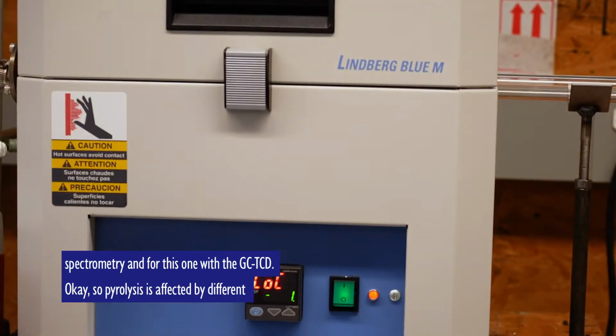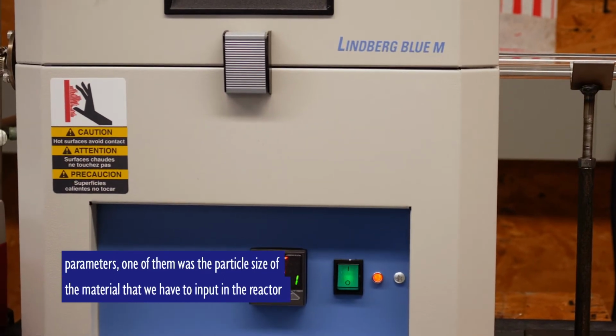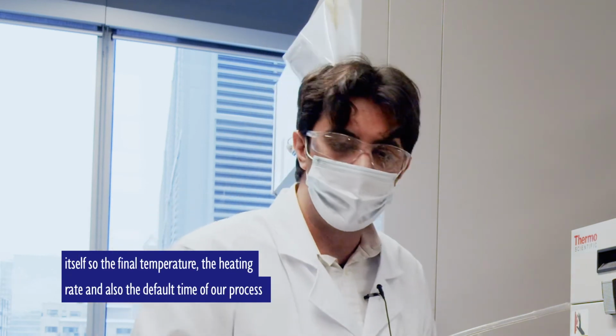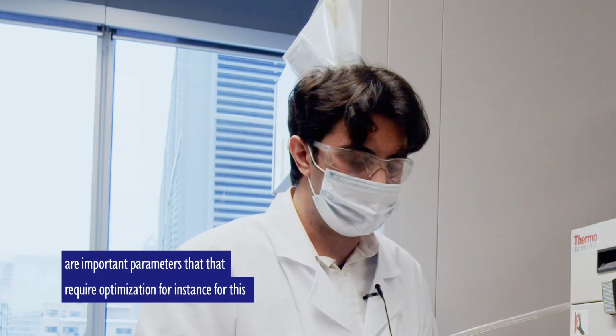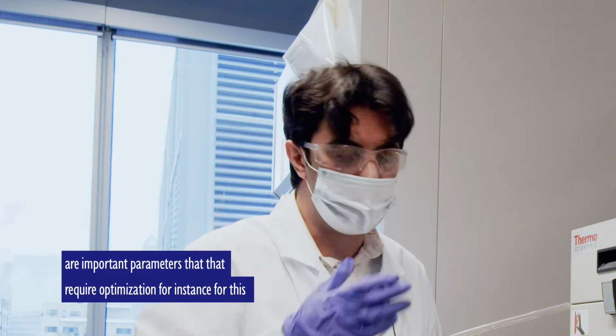Okay, so pyrolysis is affected by different parameters. One of them is the particle size of the material that we have to input in a reactor. For the reactor itself, the final temperature, the heating rate, and also the dwell time of our process are important parameters that require optimization.